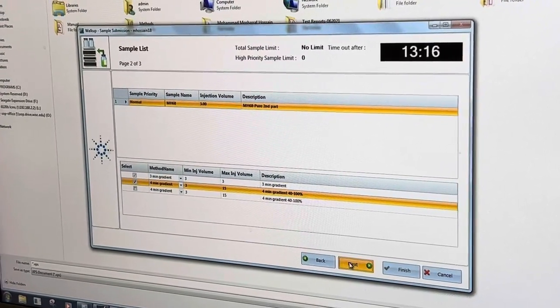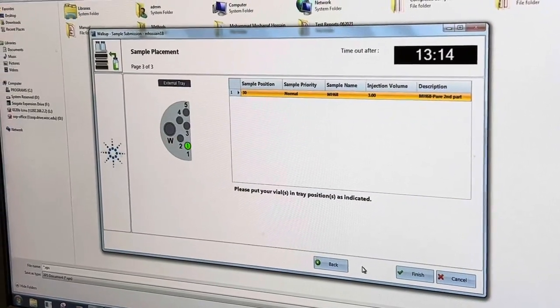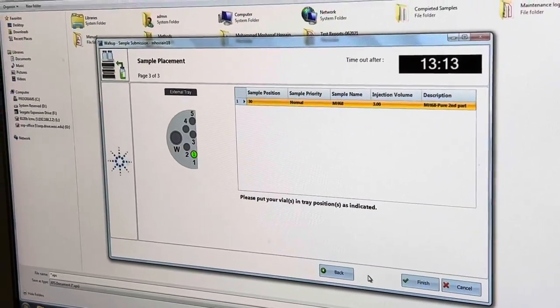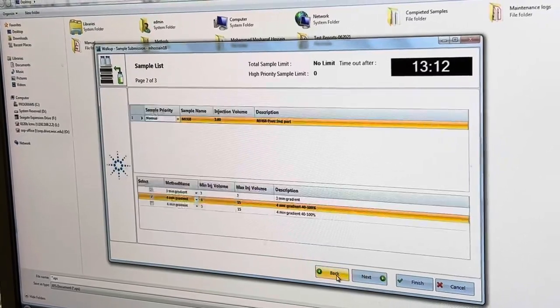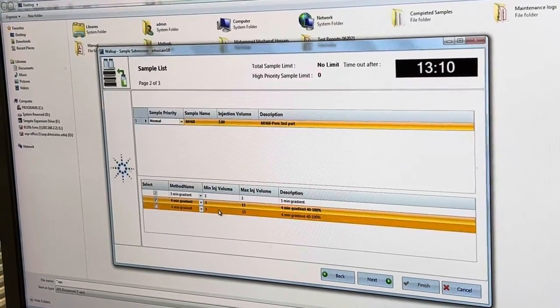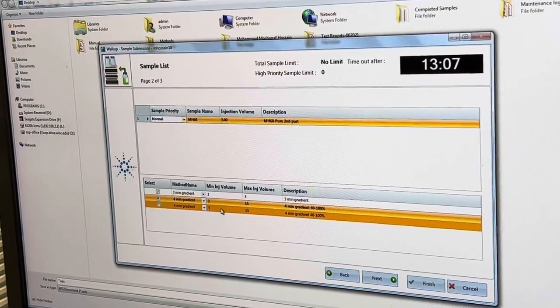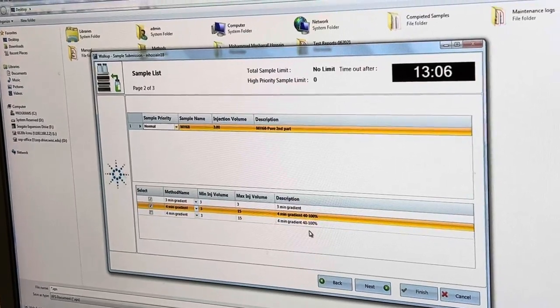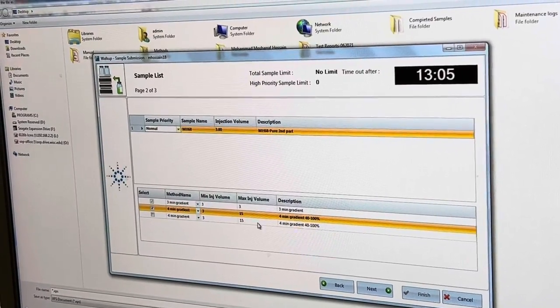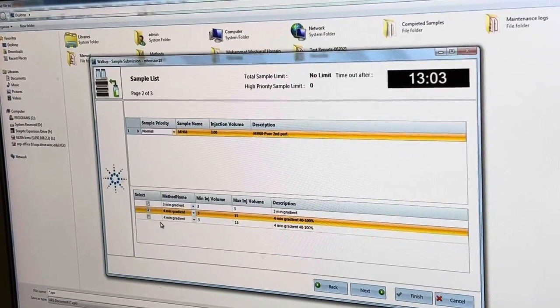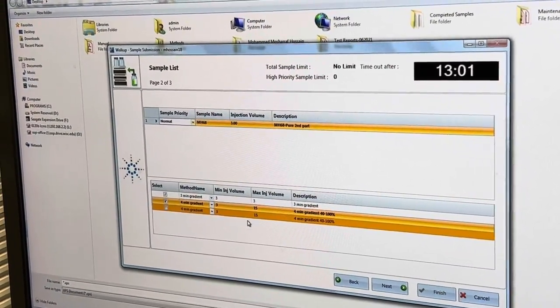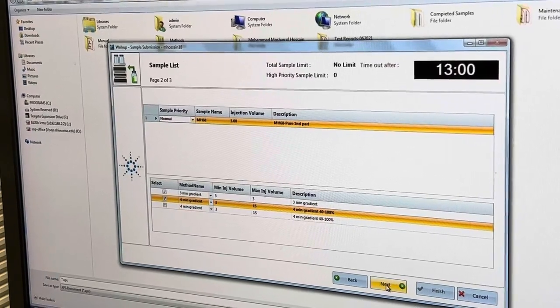Why is the one below that the same thing, isn't that identical, the third line? Still four minute gradient? Yeah but I don't know why that is. Next, definitely in the method there might be some changes.